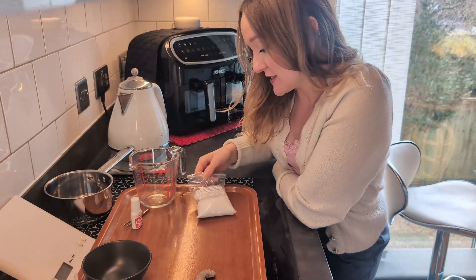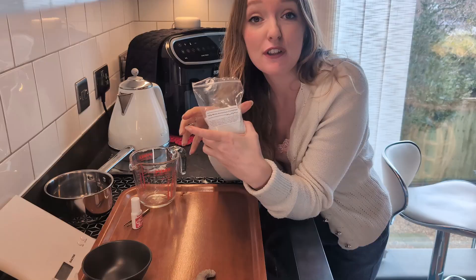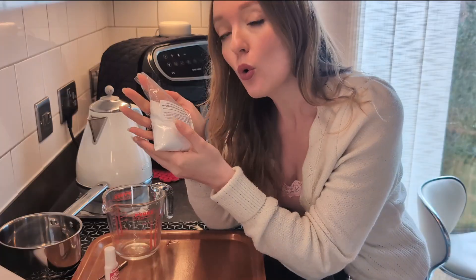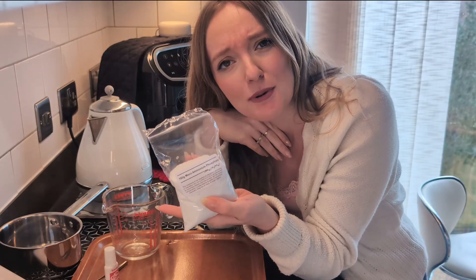Today I'm growing crystals using mono ammonium phosphate. This is really cheap stuff — you can get it for three quid online — and it makes a brilliant at-home science experiment for kids, or as I'm doing it, just a really fun little experiment for myself.